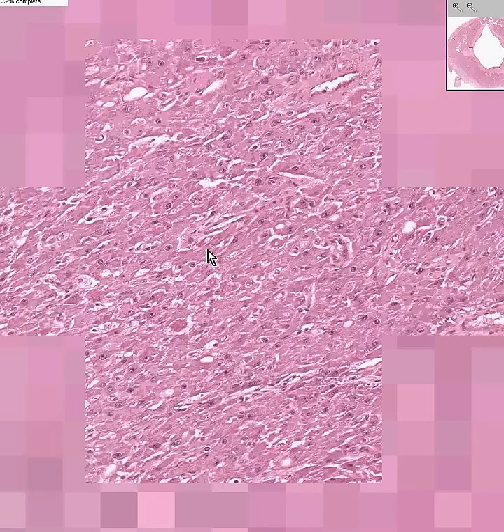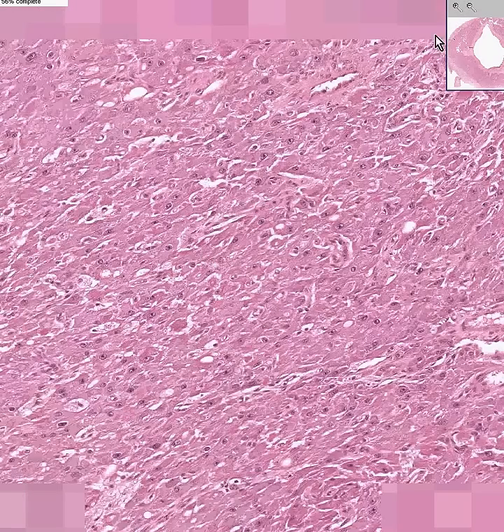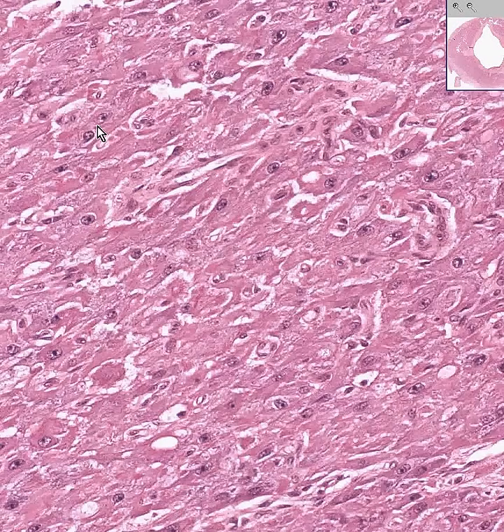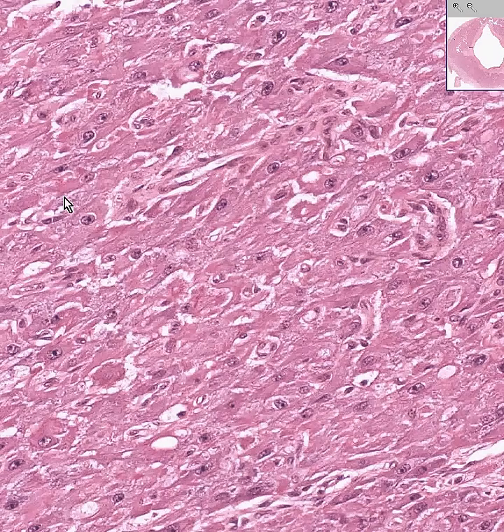At our highest power, these are typically the luteal cells of the corpus luteum. They have rather round or vesicular nuclei and a lot of granular, sometimes slightly foamy cytoplasm. These are all luteal cells.